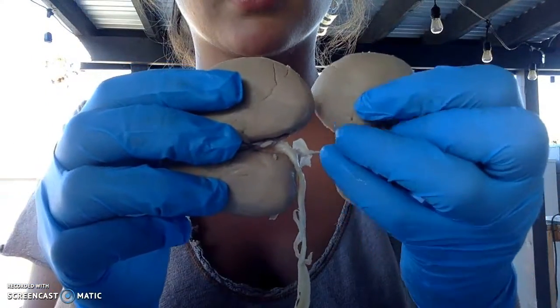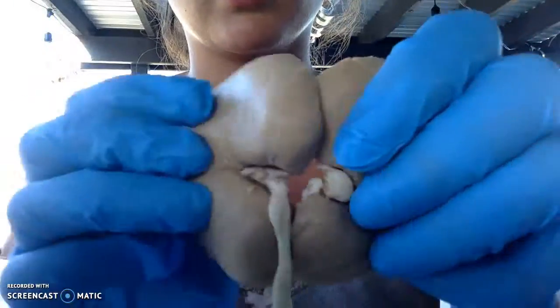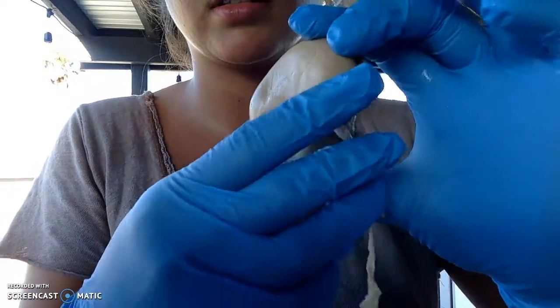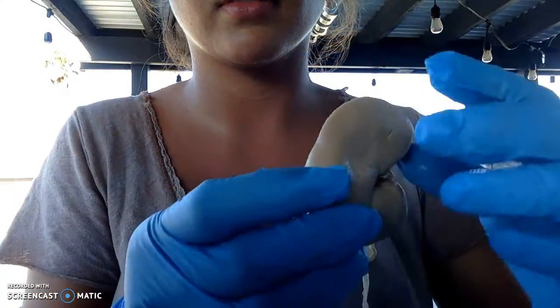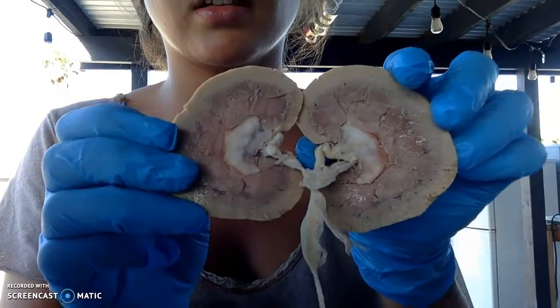This is the ureter, this whole section. And that's my kidney. This is it. On this side, there it is.